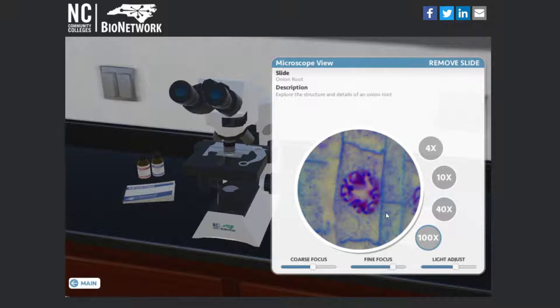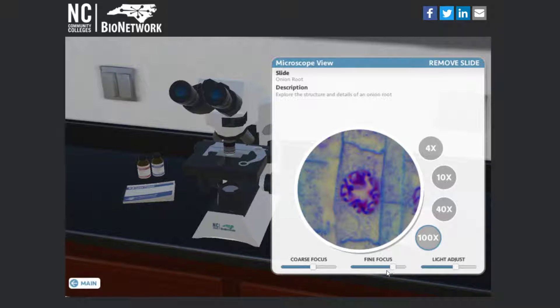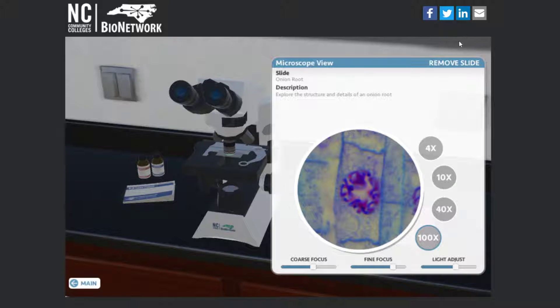And now if you look, you can really see the DNA and the nucleus. Those chromosomes have condensed together. That's really cool. You can see a lot with this little microscope.